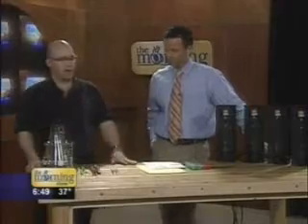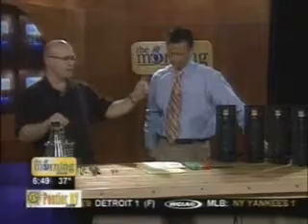All right, fluorescence. What do we got today? Well, we got several different types of fluorescence. Actually, it's all fluorescence, but we kind of categorize them differently. We have our classic fluorescence, and there's phosphorescence, which I'm not going to really show, and then of course there's bioluminescence or chemiluminescence, which I'm going to show over here. First of all, we'll show some of the fluorescent.